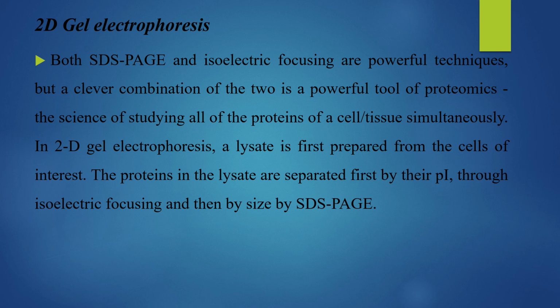Now we have 2D gel electrophoresis. Both SDS-PAGE and isoelectric focusing are powerful techniques individually, but a clever combination of the two is a powerful tool of proteomics. You know, proteomics is the science of studying all of the proteins of a cell or tissue simultaneously.